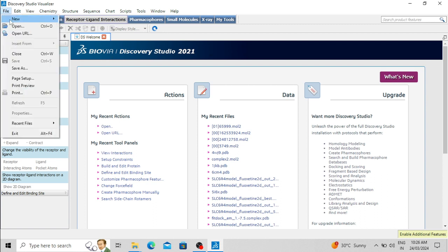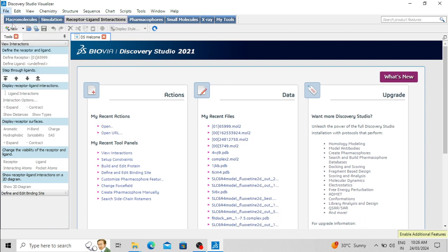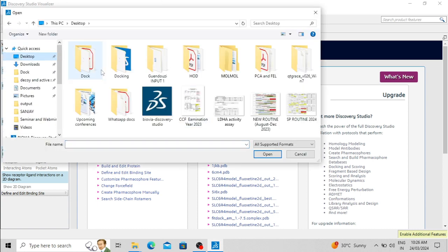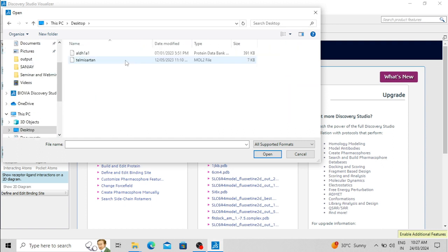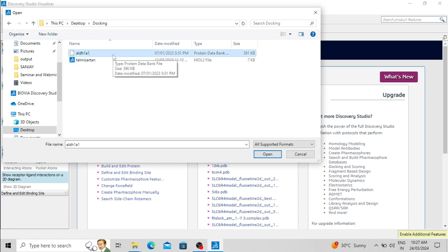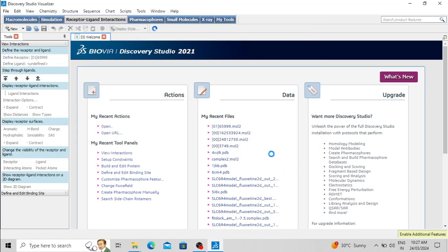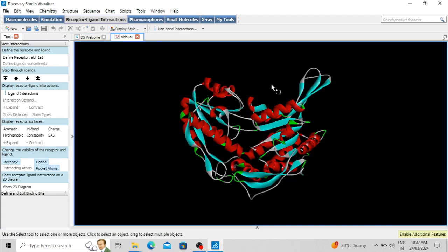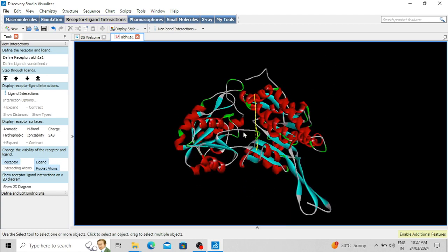To open your protein molecule and ligand molecule, go to File then Open and choose the folder where your protein and ligand molecules are available. In this docking folder the protein and ligand are present, so I am clicking on aldehyde dehydrogenase 1A1 to open it. Click Open — now you can see this is the protein molecule.